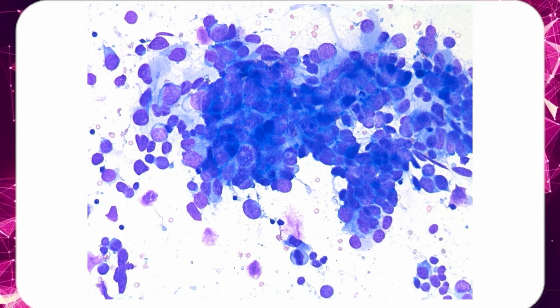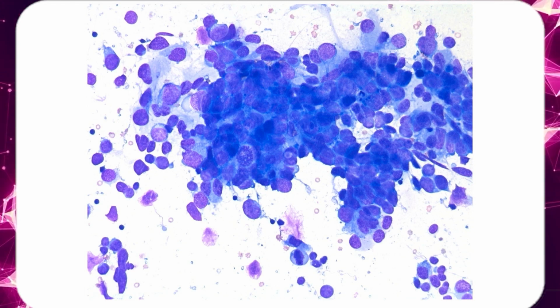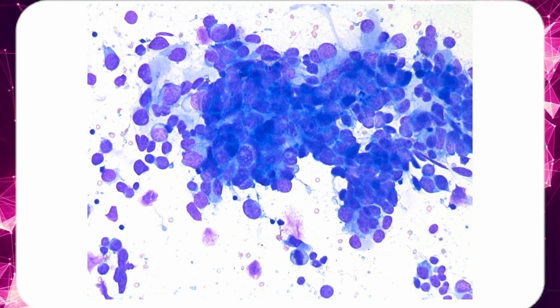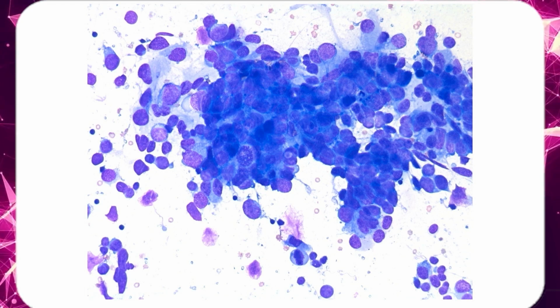So, clearly epithelioid-looking, high NC ratio cells, macronucleoli, quite pleomorphic, mostly cohesive, some single cells as well, mitotic figures, maybe some stroma or something is seen there. Lymphoid, maybe. There is a little bit of basophilic cytoplasm, but to me they look more epithelioid and have a little bit more cytoplasm than what you expect to see in a typical lymphoid lesion, unless it's a special type of lymphoma.